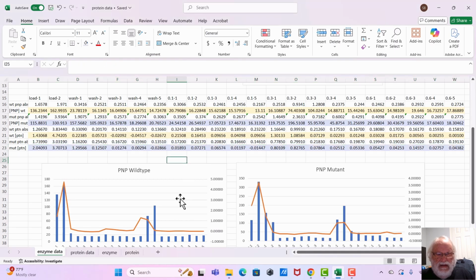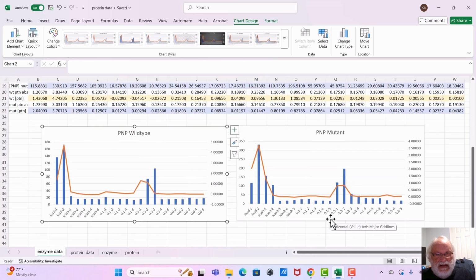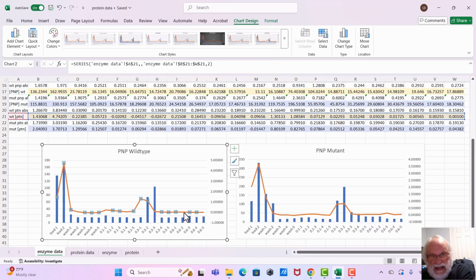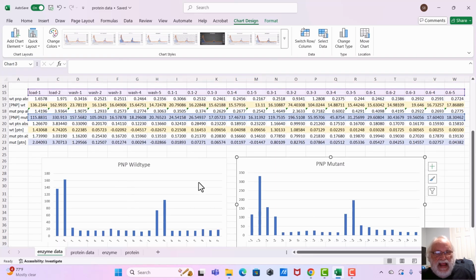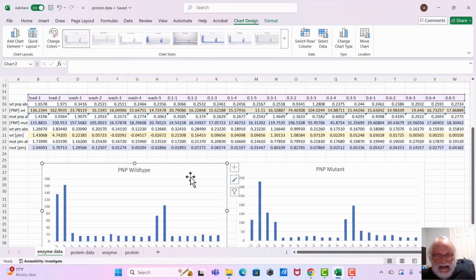Oh my gosh, these values come in. For some reason, the data was already in here, but I think maybe from a practice session. But let's go ahead and remove these data points. Just click on them. It gets rid of them. Okay. Now we're going to go ahead and add that data in. I'll show you how to do that, even though it looks like I had already done it before, but let me take you through the steps.